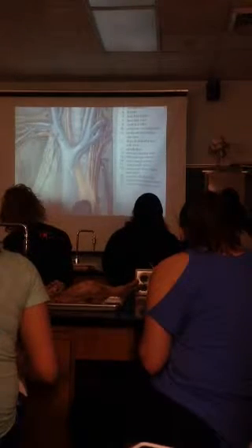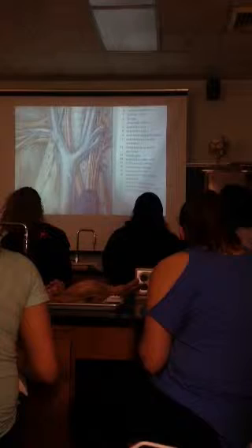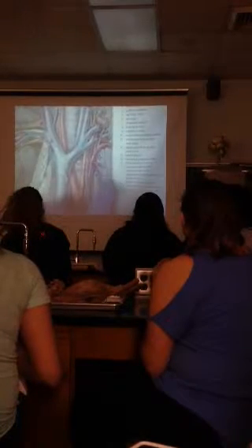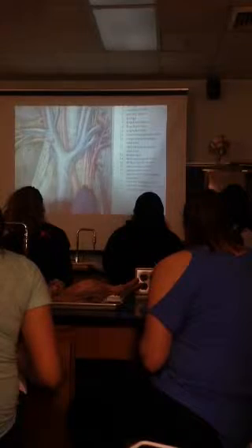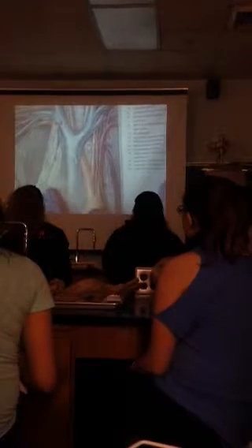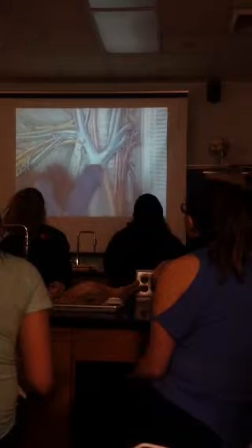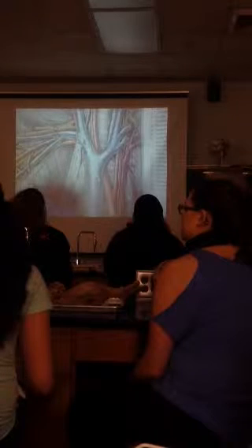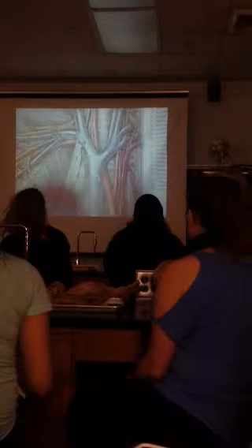But on the left side, it's going to go straight up into the subclavian. And then into common carotid. So you're going to see these two common carotids this way. It's a little different down here for the cat. So from there, you go over, and it's subclavian. When you see subclavian, you need to be thinking underclavicle, right under there.